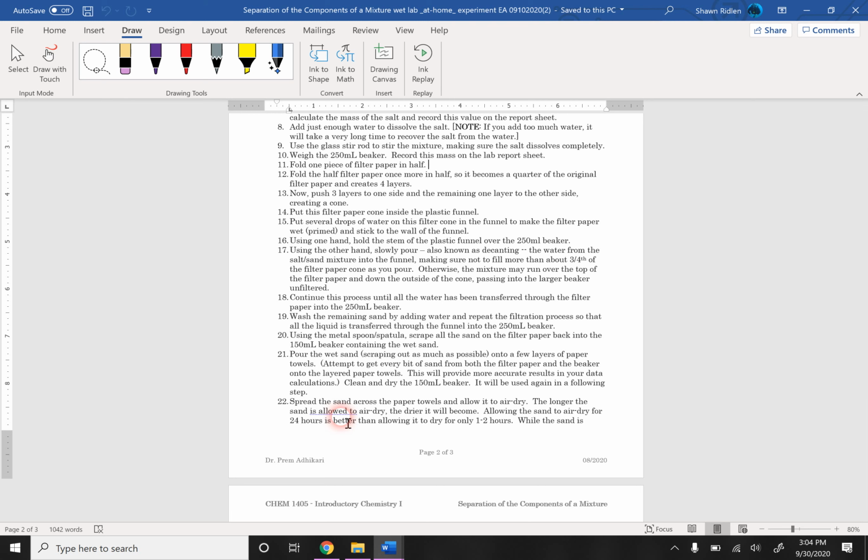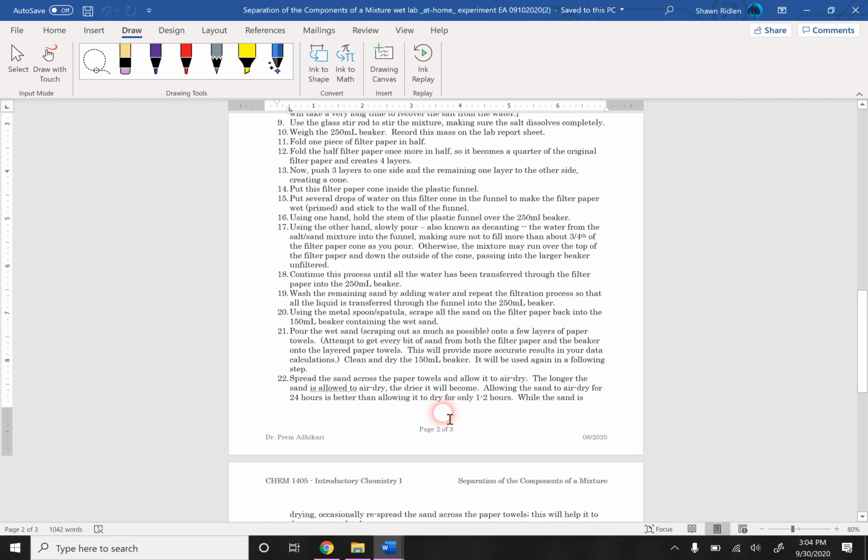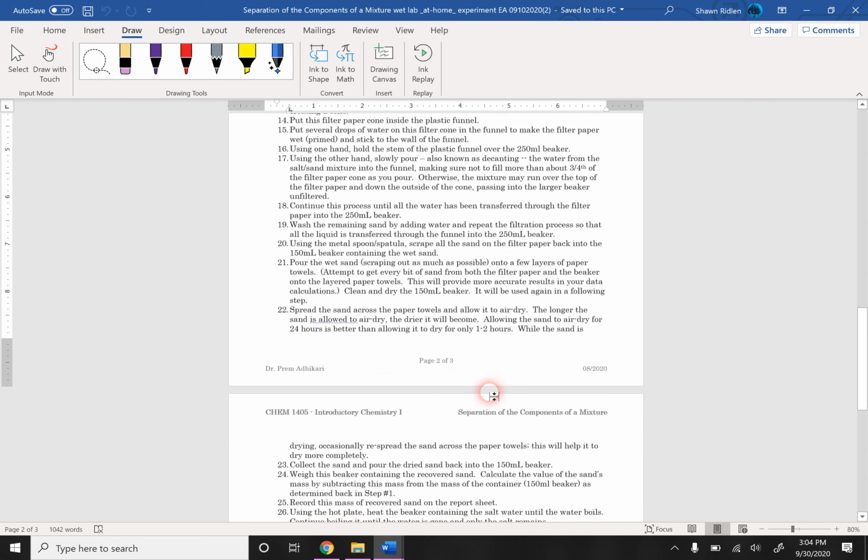And when I say low, I mean probably the lowest setting you can, just above room temperature, basically. And that way you don't run the risk of anything catching on fire or anything like that. But again, that's not necessary, and honestly, it probably is overcomplicating it.